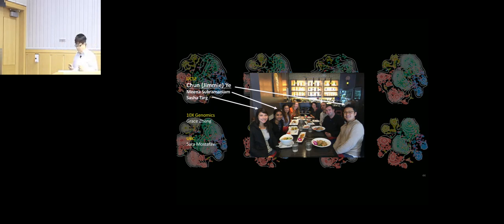When you're trying to assign the reads that you get from the single cell to an individual, you've got a small amount of reads, or a small amount of cells, that you're misassigning.